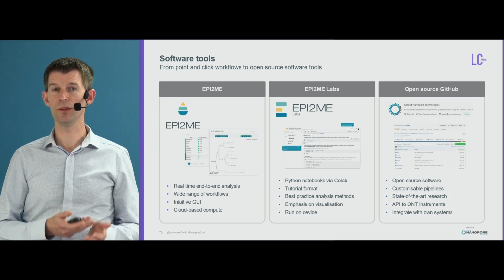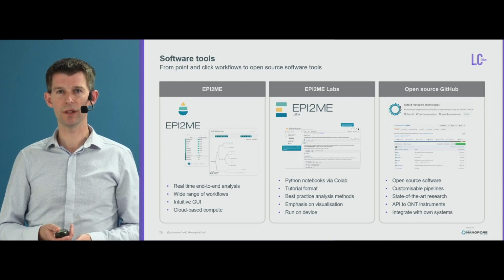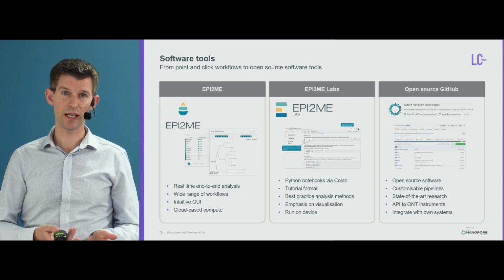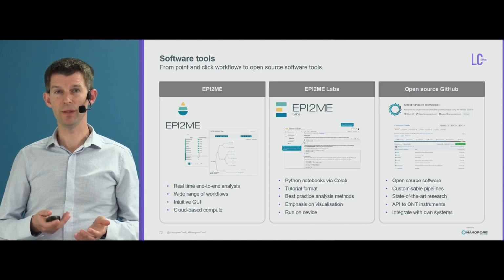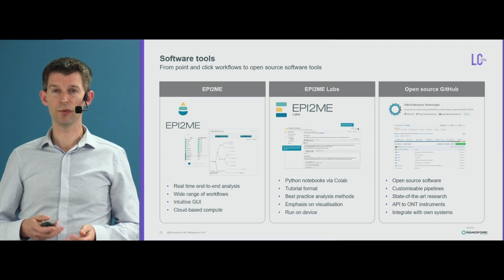That's your simplest solution. If you want to learn a little bit more about what's going on, perhaps tweak parameters, play with our data sets or your own data sets, then we've got EPI2ME Labs, and that's where we're going to deliver all our tutorials. And that comes as a pre-installed environment.